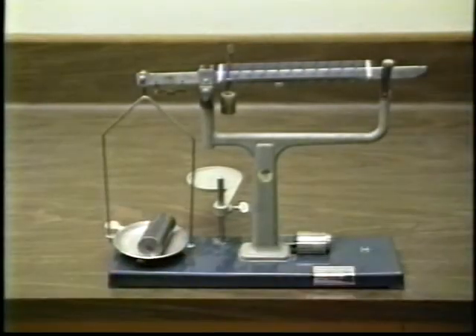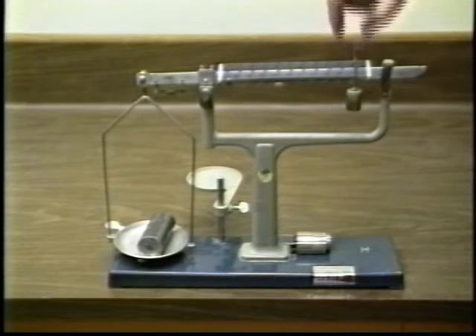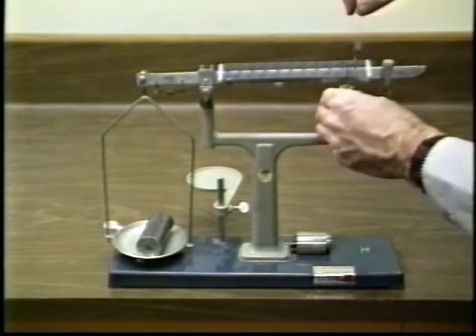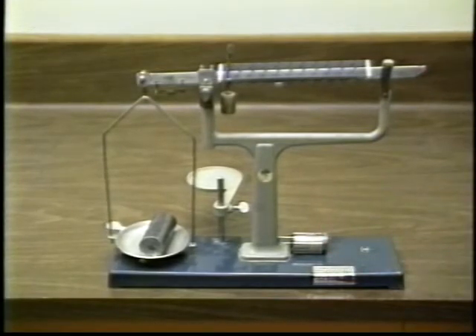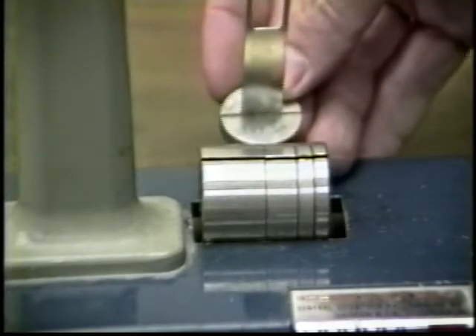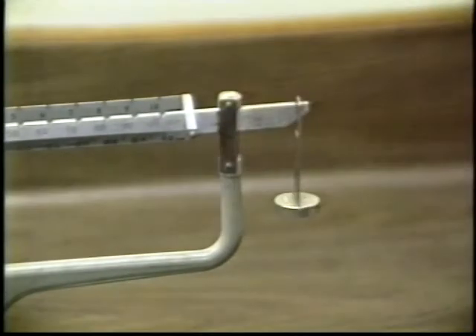The normal capacity of the balance is 111 grams. If an object has a mass larger than that, there are accessory masses available at the base of the balance which increase the capacity. This accessory mass has 100 grams printed on it, but its actual mass isn't 100 grams. However, when hung from the right end of the beam, it increases the capacity of the balance by 100 grams and will balance a 100 gram mass placed in the balance pan.